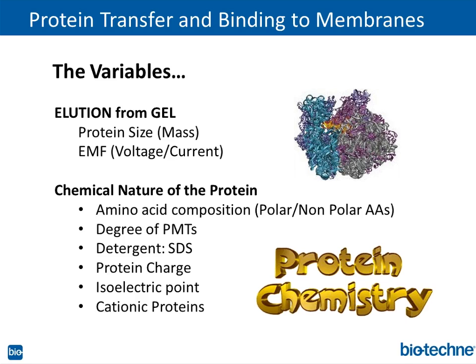The other situation, related to cationic proteins, was someone working with histones. As you may know, if you're studying epigenetics, histones are basic, highly positively charged proteins. People are looking at post-translational modifications on the N-terminal tails, methylations, acetylations, and the like. Because this protein is highly positively charged, guess what direction it could potentially go in? It's not going to run to the anode; it could potentially go in the opposite direction. And yes, I know there's SDS, your anionic detergent, but some of that gets washed away. So I simply had the person put the membrane on the opposite side to catch that protein.